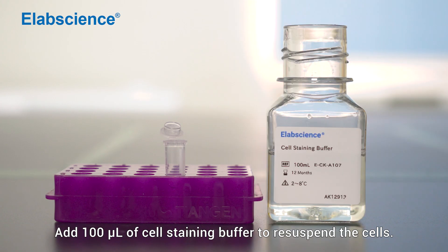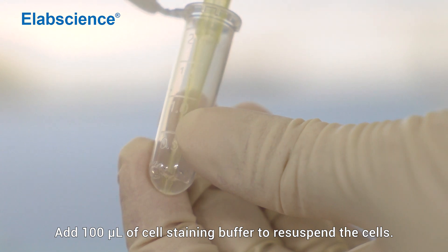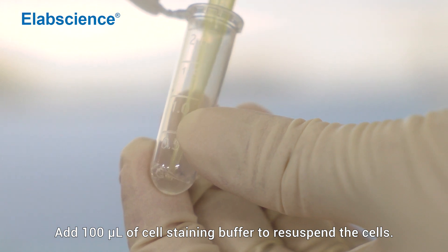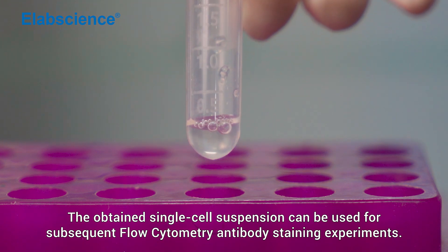Add 100 µL of cell staining buffer to re-suspend the cells. The obtained single cell suspension can be used for subsequent flow cytometry antibody staining experiments.